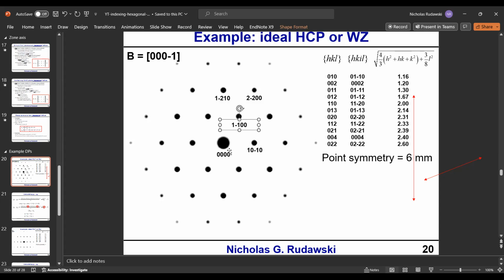And now these are opposites. Two bar 2, 0. And now this is the opposite of this. -1, 2, -1.